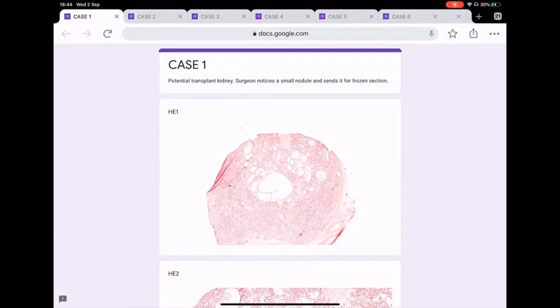I have a question here: if you have a spindle cell lesion in the lung, do we defer as it can be a benign one like SFT? Well, the thing is that you are not particularly deferring the case. Remember, you have given a diagnosis. Providing that you were able to say this is not a scar, this is not fibrous tissue, this is not small cell carcinoma, this is not non-small cell carcinoma, then you are able to say, yes, this is neoplastic tissue. It's a spindle cell neoplasm. We cannot characterize it further based on these sections. We need to examine it more to determine if this is benign or malignant and to be able to subtype the different line of differentiation.